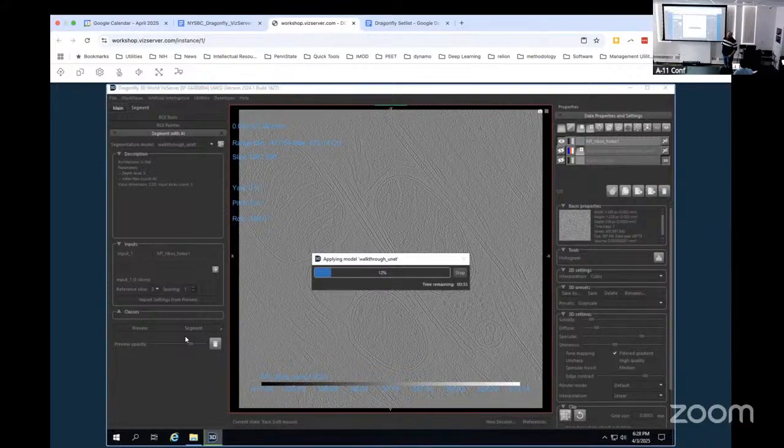I actually don't know exactly how it's going to. It kind of does. Now it's pretty good. Yeah. Yes. Yeah, it's all background. Okay.